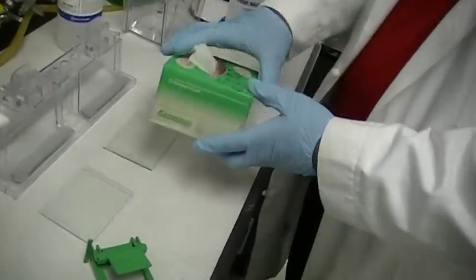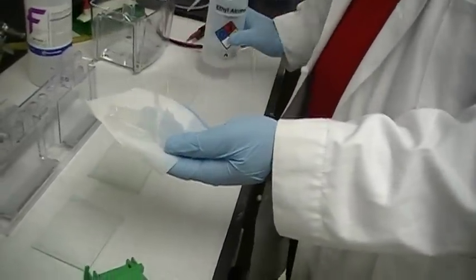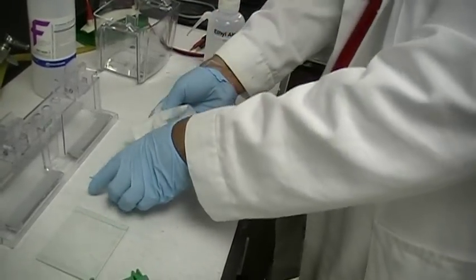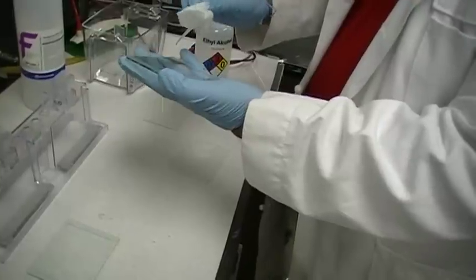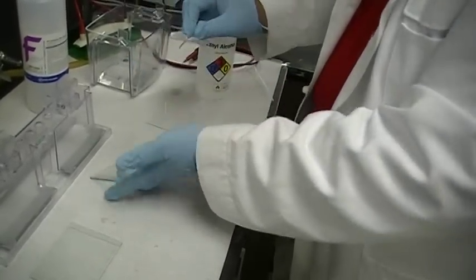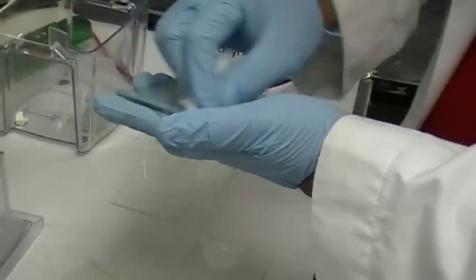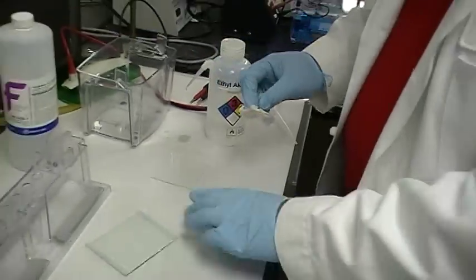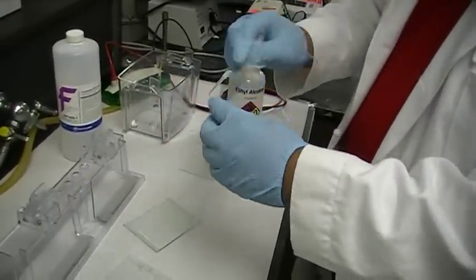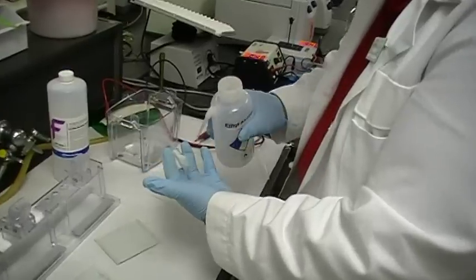Get a box of Kleenex and a Kim wipe, and moisten it with 70% ethanol. The reason we're doing this is you need to remove every speck of dust on this plate. If you don't, it's going to obstruct your gel. So you just wipe this out — the spacers and the plates — like this. Pick up the other one, same thing. Wipe out all the dust from the glass plate.